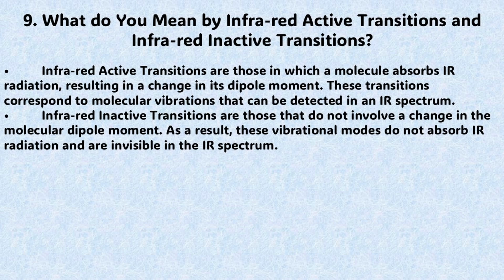Infrared active transitions. These are those transitions in which a molecule absorbs infrared radiation, resulting in a change in its dipole moment. These transitions correspond to molecular vibrations that can be detected in an infrared spectrum. Infrared inactive transitions. These are those transitions that do not involve a change in the molecular dipole moment. As a result, these vibrational modes do not absorb infrared radiation and are invisible in the infrared spectrum.